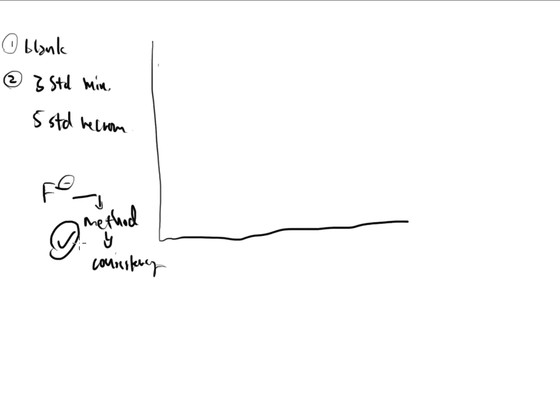So you're working with a group of people that's all working on the same project, trying to figure out what the best settings are for this method and to analyze these types of samples. So very often, one of those questions is always where? Where do I start my calibration standards and where do I end? Well, the first thing that you have to do is look at your samples. What type of samples are going to be presented? And what is the expected concentration range?